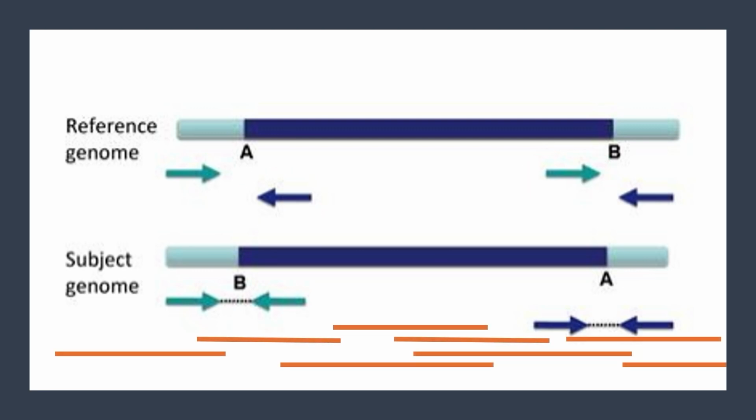Many reads from the inverted segment in the subject can align well to the reference if IGV flips them. And the IGV will do that, especially since inversions are often very large. Their entire length is probably not spanned by a single read. Instead, it may be composed of several separate reads, indicated here by the orange lines, many of which can simply be flipped to get them to align without a big mess. So the reads lying entirely within the inversion or entirely outside of it will carry no mismatched nucleotides indicating a mutation, as we are used to seeing.